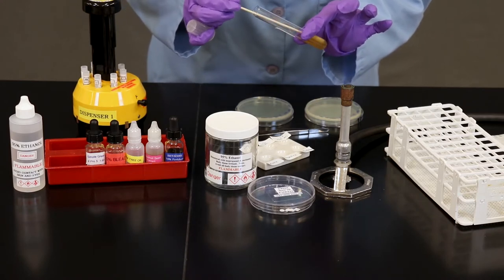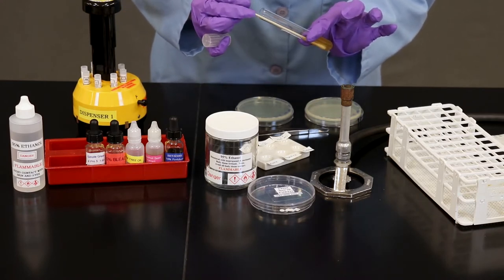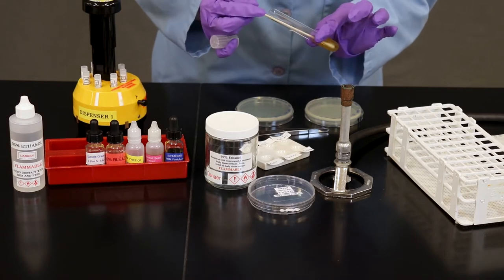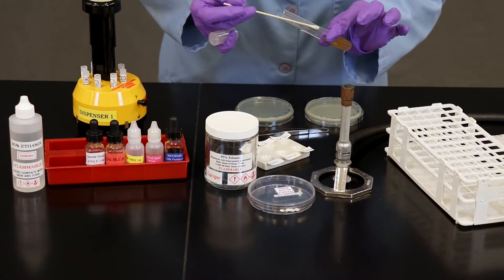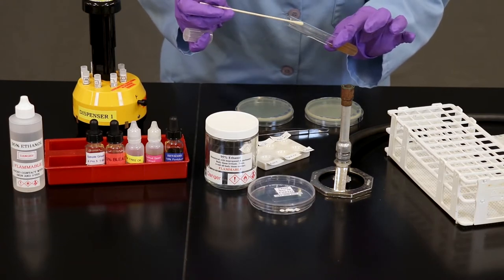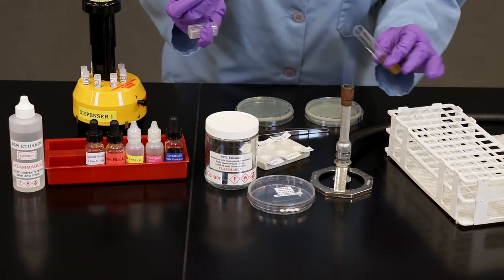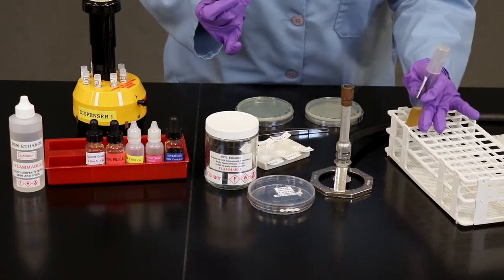Dip to saturate your cotton swab. You can let it sit a few seconds. Be sure not to stick your fingers into the test tube. Rub the side of the swab on the test tube so that you can get rid of any excess droplets. Pass the opening through the flame. Place down.